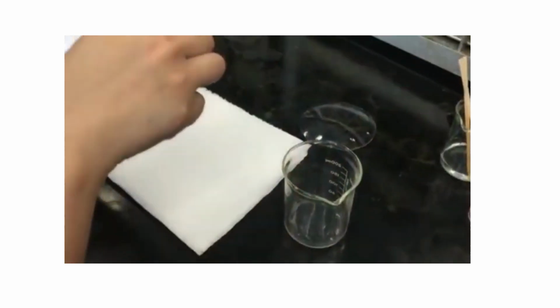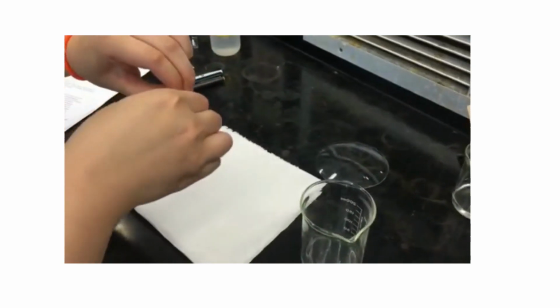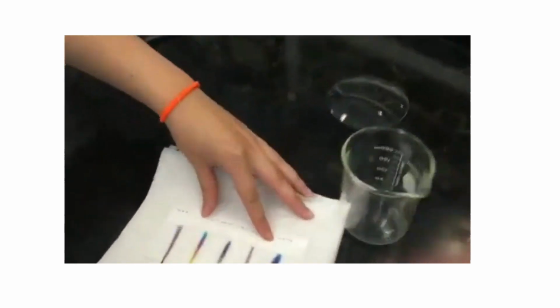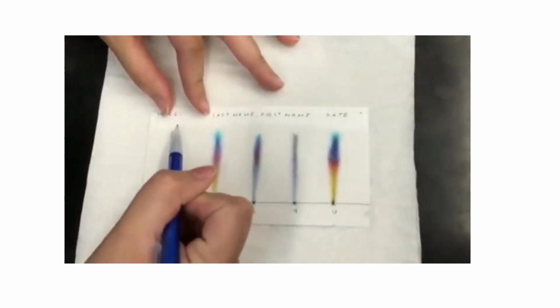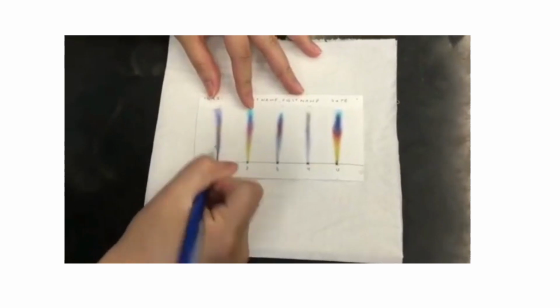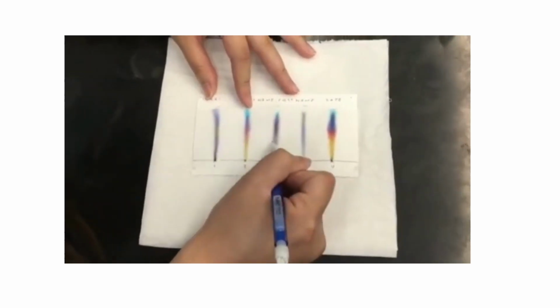You can see the plots, and here the visualized chromatogram is shown. But you have to visualize using ultraviolet radiations or iodine chamber. See, there's a known one, and this one is the unknown strip. This marking is the solvent front, or we have to find out the distance from the edge to that of the solvent front, and then you have to see the RF values.